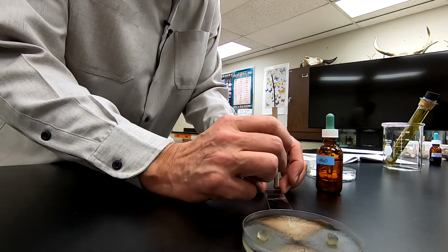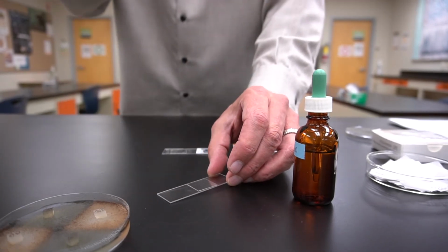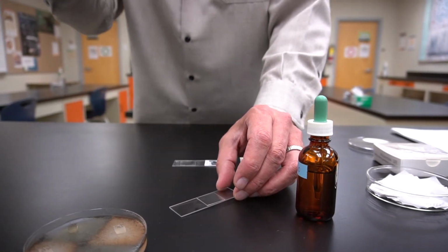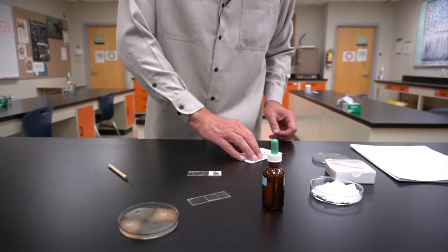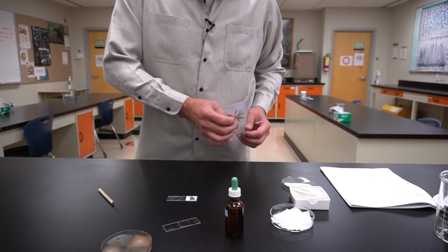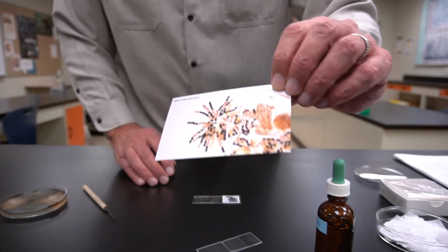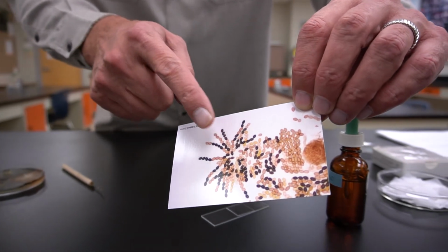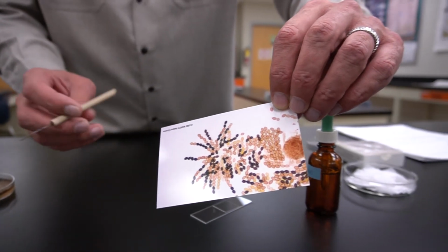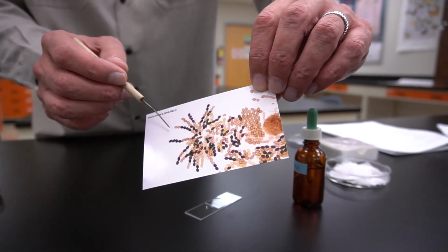And then you gently press, and you can sometimes even feel these black hard perithecia breaking open. And when you do it right, and the timing is perfect, you get an array of asci from the broken perithecia, and you can so clearly see the different spore color patterns in this row of 8 spores.